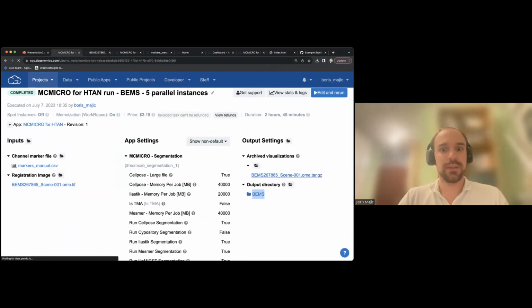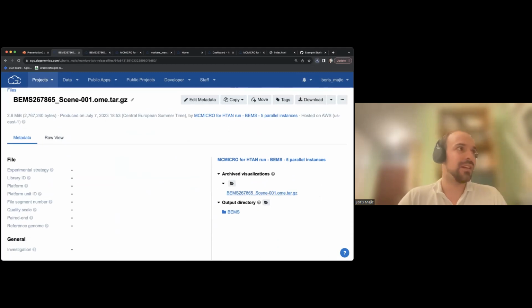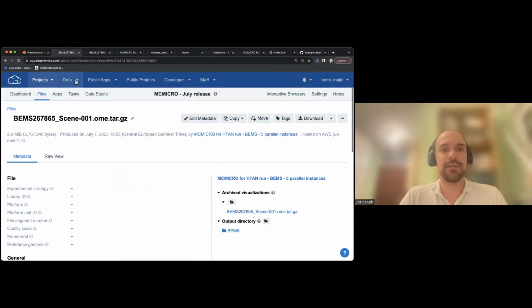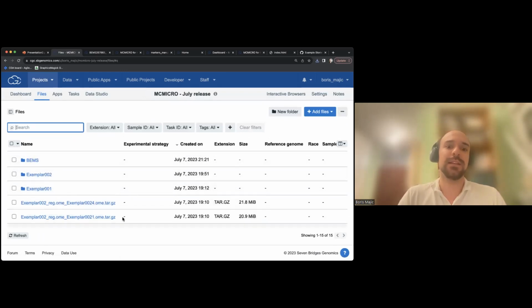The second output, let's see how big this is. Okay, it's not that big. It is the AutoMinerva visualization. This is a collection of many files, and due to the CGC file structure and the way we keep track of files, these files are all present on a volume somewhere, and the HTML report generated by AutoMinerva isn't able to track where these files are.